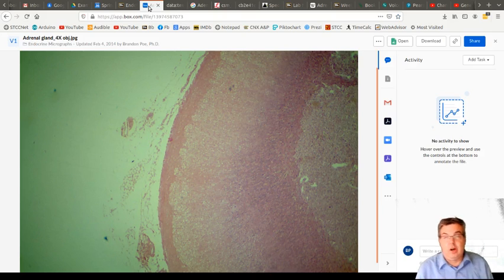Staining quality tells you a lot about the functional aspects of the tissue, just in what's going on in the cells, what they're secreting. They appear different in the way that they stain.